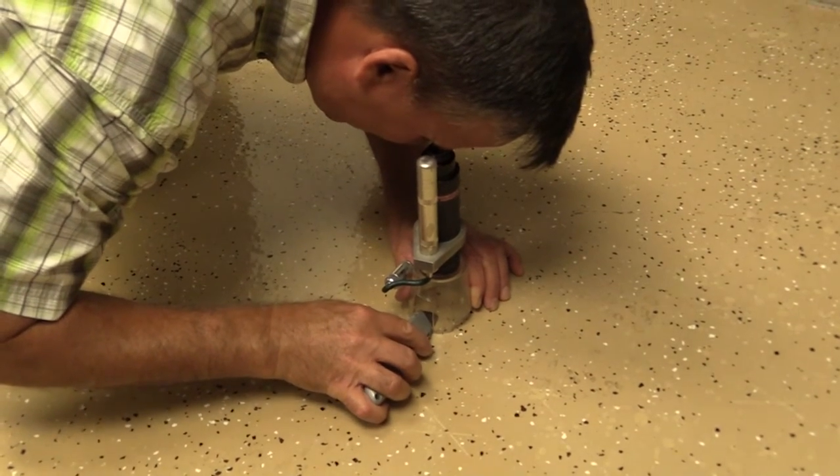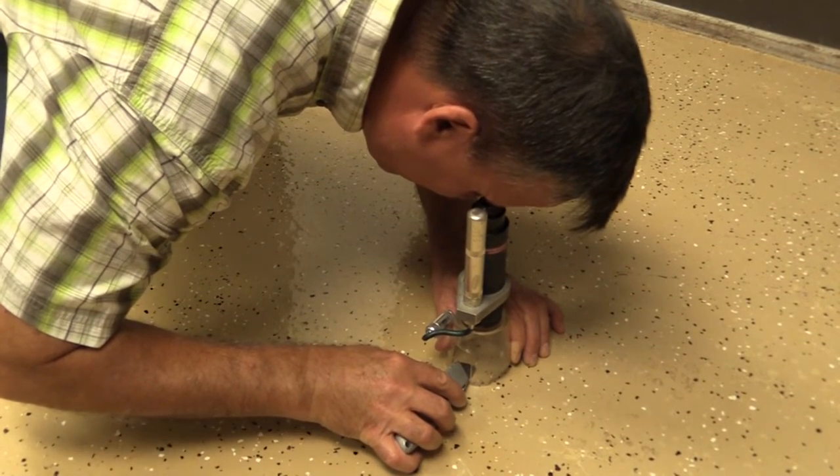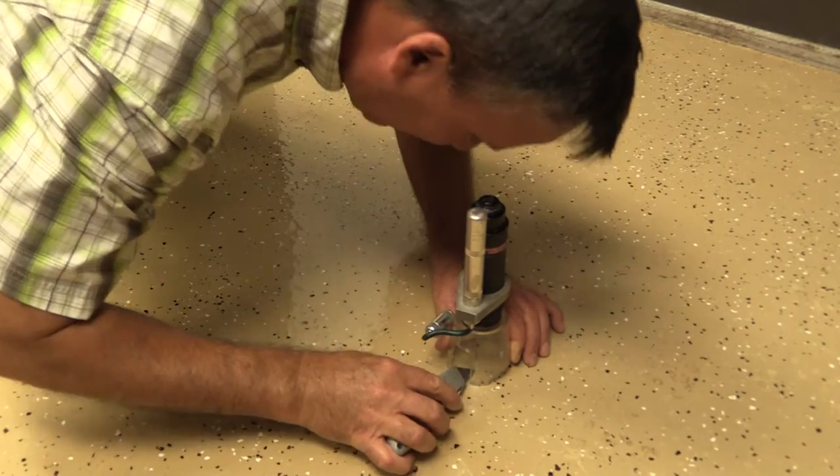A microscope with a large field of view is a plus, especially one that has an opening that will allow for a knife to be used to probe the surface while viewing under the microscope.